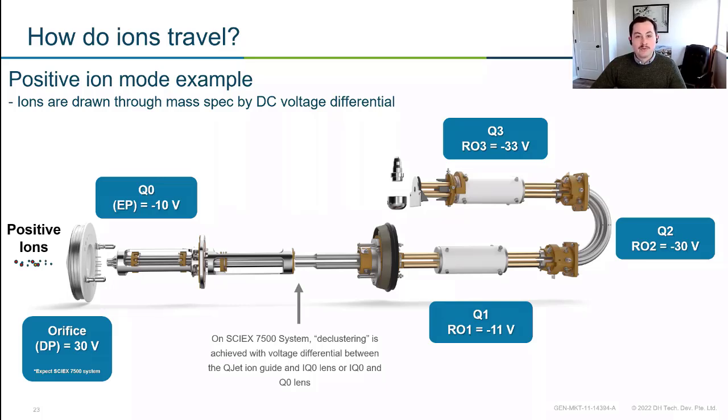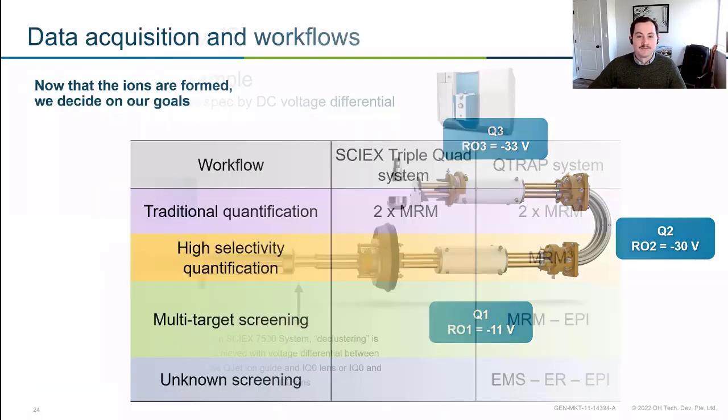Q2, you'll hear people refer to as the collision cell or Q2, and they're both the same thing. You can use those terms interchangeably. It's really just referring to where that fragmentation happens. So instead of using this quadrupole as a filter, here we're going to be applying some energy to create something. And in our third quadrupole, that's where we return to using that quadrupole as a mass filter. So if we take a second to think about that selectivity, we have a first mass, we're doing an experiment on that mass, and then we're filtering it again. And that's where we get into some of the fun.